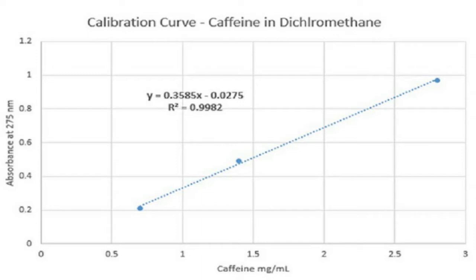Moving on to the data analysis involved in this lab. Here we can see the calibration curve needed to convert that absorbance we just found into a concentration of caffeine. Known concentrations of caffeine were measured in the spectrophotometer, and resultant absorbances were found, and this graph is generated. Using the equation from the line of best fit, we can plug our found absorbances in for y and find the x, the concentration of caffeine.